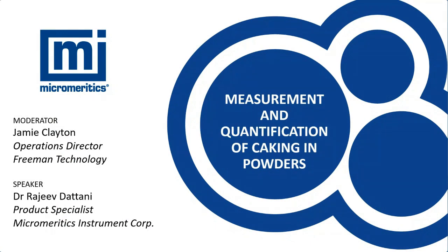Today's presentation is on the measurement and quantification of caking in powders, and your speaker is Dr. Rajeev Dattani, who is Product Specialist at Micromeritics Instrument Corporation.